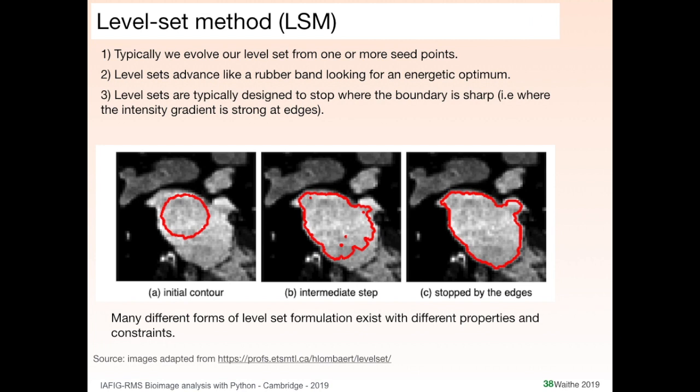But it's important to understand that these are generally algorithms with many parameters, and there are ways of tailoring them to different images. At the moment, they're not as fashionable as they once were, because machine learning has come along and transformed the field, but they're still very powerful. If you need to encode very specific things about the shape of your cells and things like that, then you can do it through this methodology.